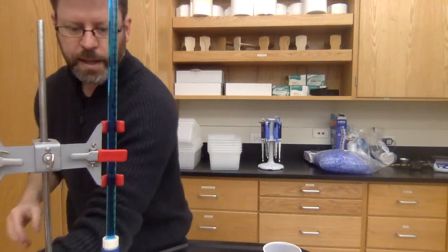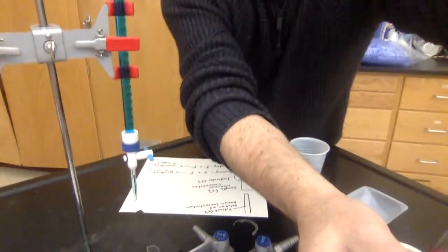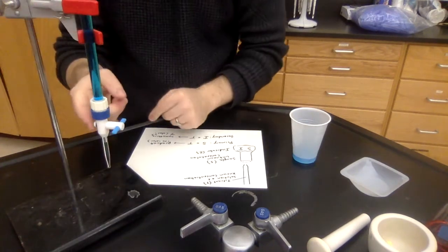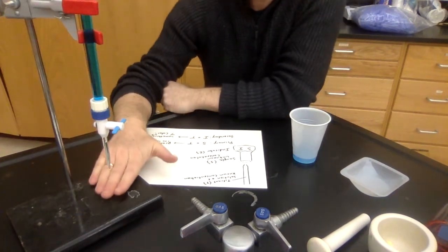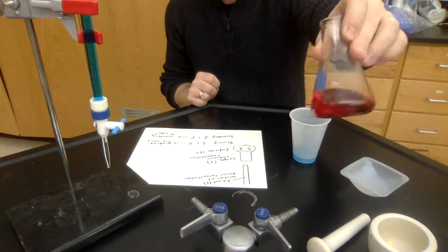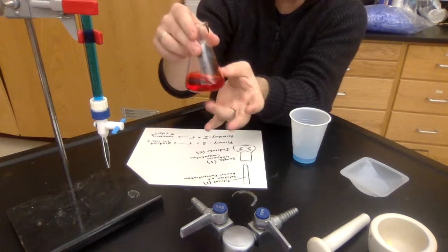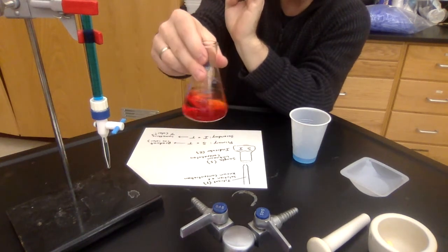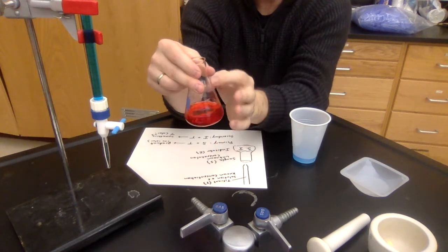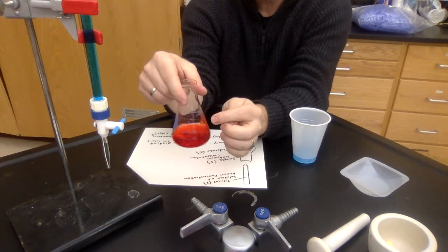So I have my clamp in here. So here's the tip. Here's the surface. This is my simulated sample. Okay. You want enough sample in here, like liquid-wise. You want enough sample so that you can stir it around pretty easily. You don't want too much, because you are about to put more liquid in here as well.